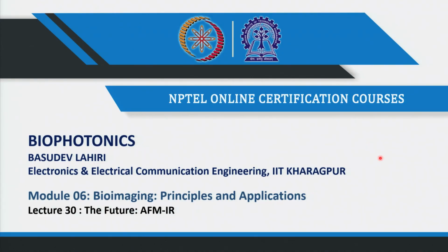So, I work with this particular technique called AFM-IR, atomic force microscopy infrared spectroscopy. It can also be called PTIR, photothermal induced resonance, and this very well can help you break the diffraction limit. Again, coming back, it is equivalent to, or for me slightly better than, NSOM. So, what is it, or why do this anyway?